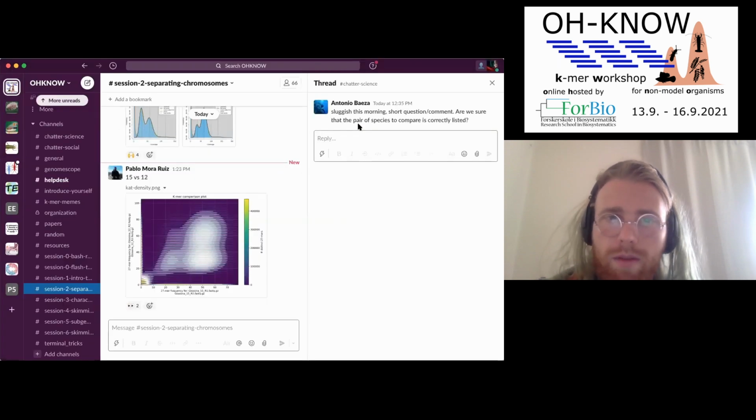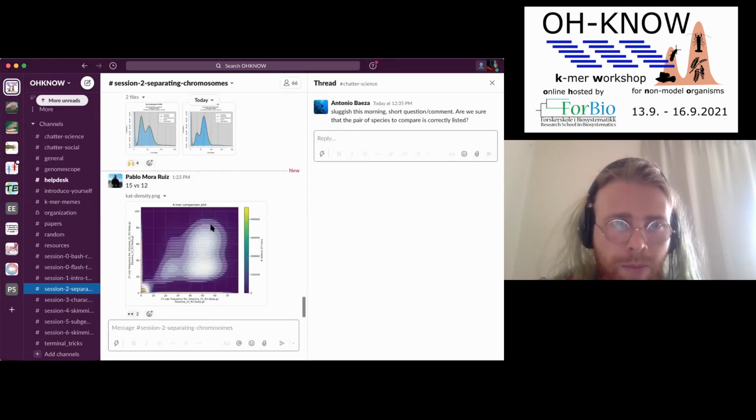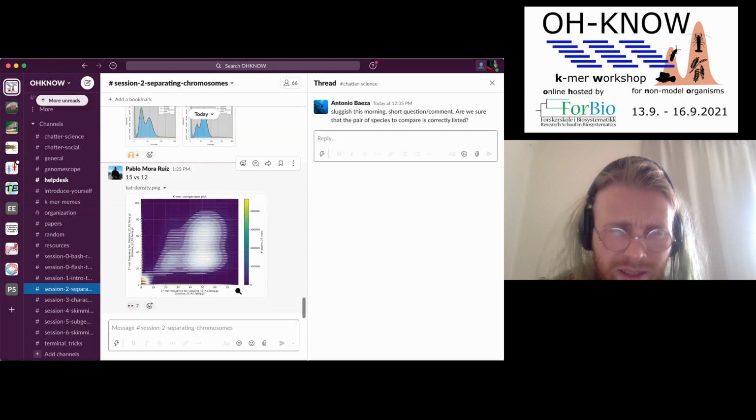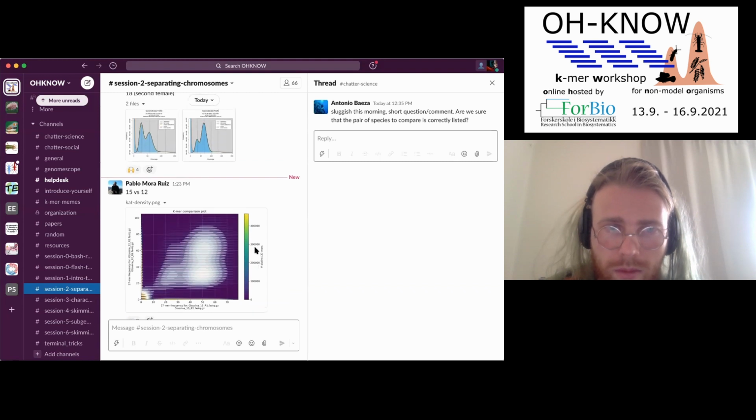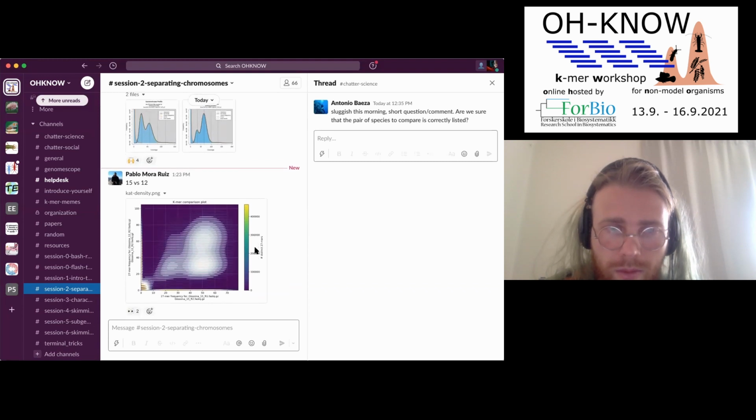Why does it work? And I guess that's it. This is really weird. So in this case, I would take the matrix file and find the cat function that regenerates the plot and redo the plot again. So it's the second plot, so it's redone. I mean, it's with the second command you told me.